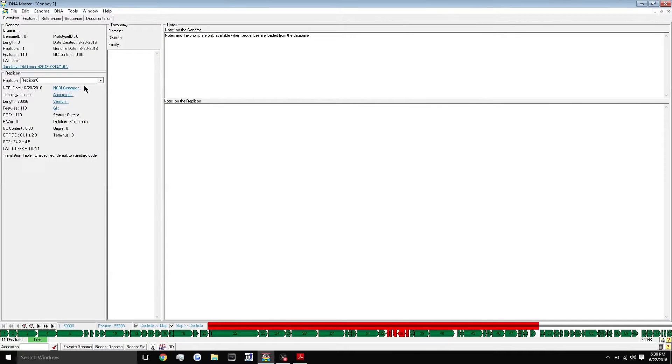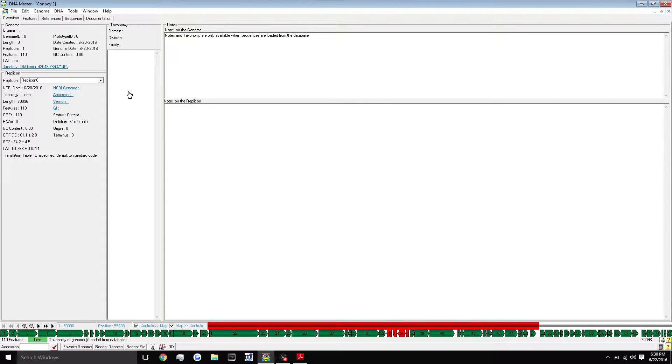Hey everyone, welcome to your fifth DNA Master tutorial. Today I'm going to be showing you guys how to run the blast function.